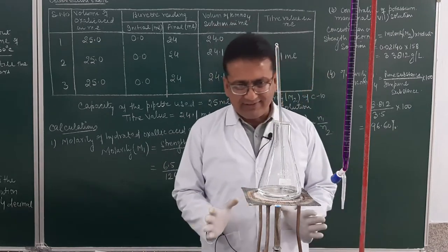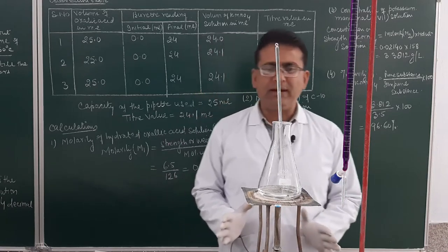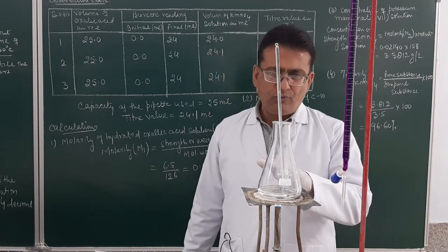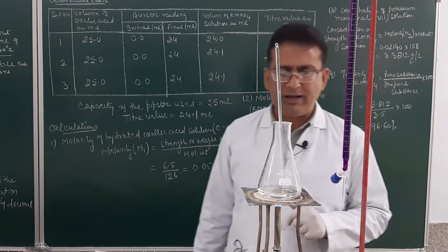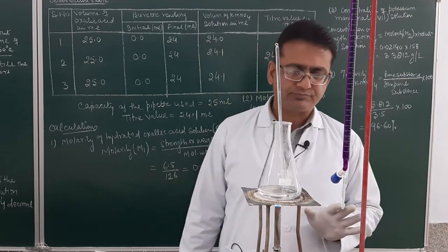You can see the level over here in the thermometer, and whenever you find that this is heated up to approximately 60 degrees C, the first bubble will appear. You must keep a distance to see the first bubble appearing at the bottom of the flask. Am I getting clear, student? So what have we filled up in the burette? A KMnO4 solution. Then we are now heating the solution of oxalic acid and the H2SO4 till the first bubble appears at the bottom of the flask.